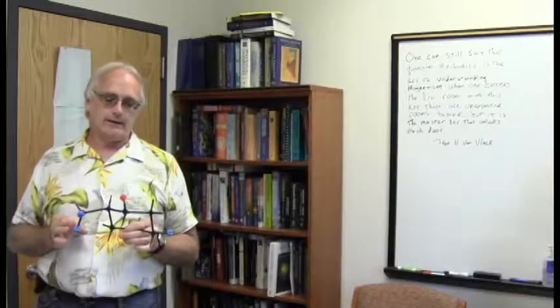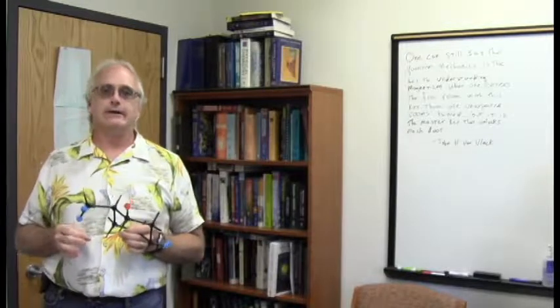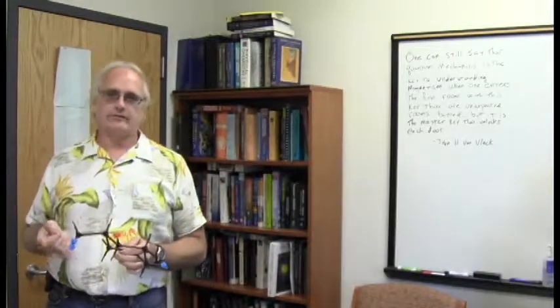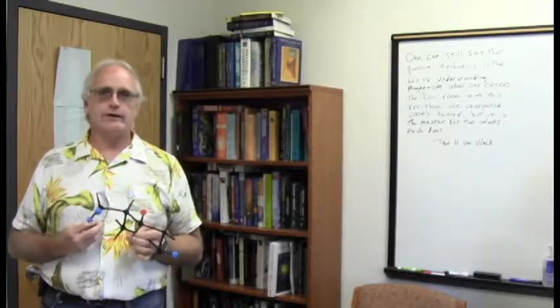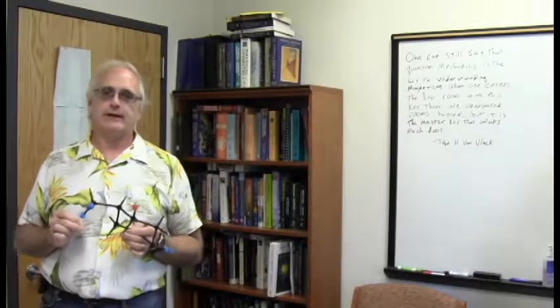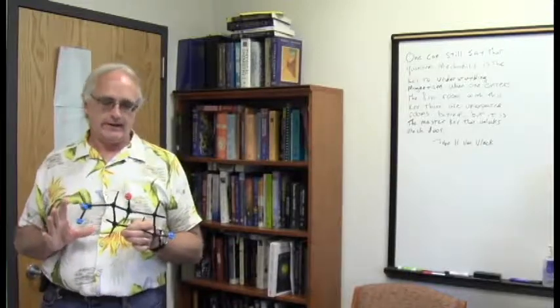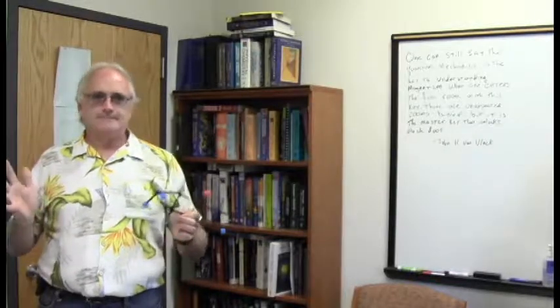Someday, someday. But I want you to see how the 2D NMR spectra represent an order of magnitude increase in the power of this technique. It allows us to take molecules like this with terrible overlap problems and still be able to go through there and make our assignments and try to understand what's going on in there. It is truly one of the most powerful structural techniques we have available. And if you don't look at how this works and just simply stand back and be amazed at it, well, you just have no soul.